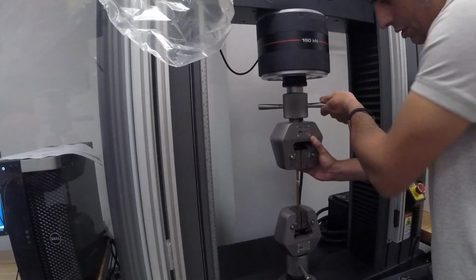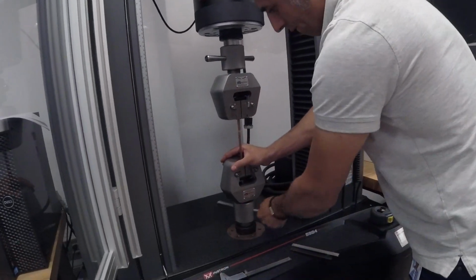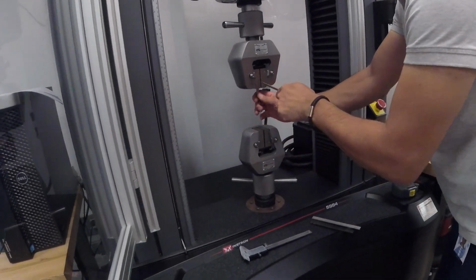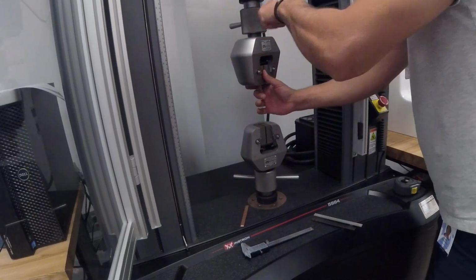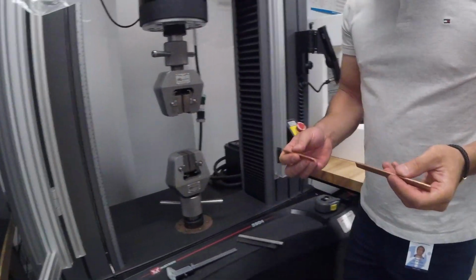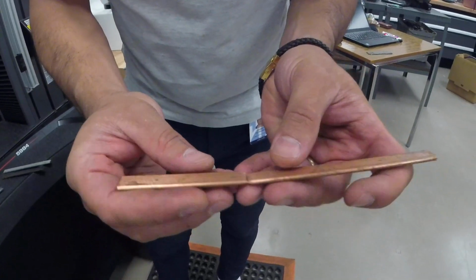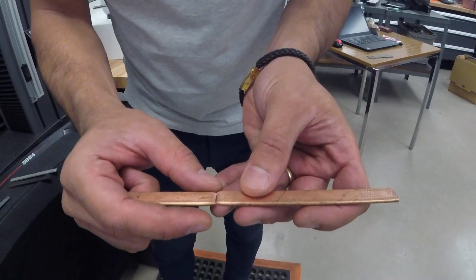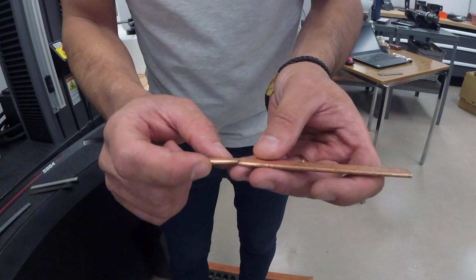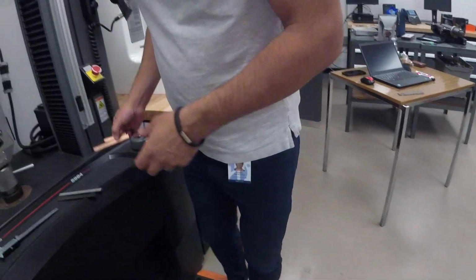And if we just have a look at our sample, this is how breaking happened. Look at that, the area reduced here, and then at the end no more reduction, and the sample gave up and was broken. So this is our first sample, copper.